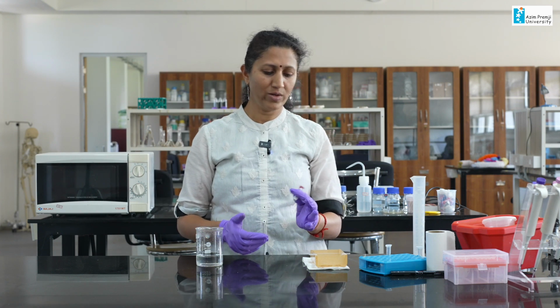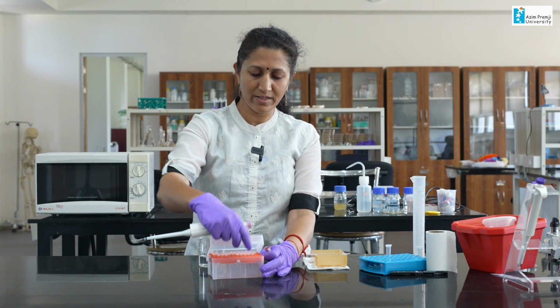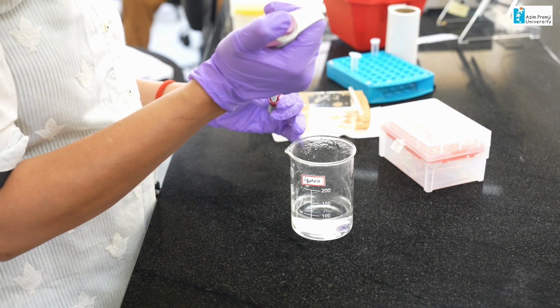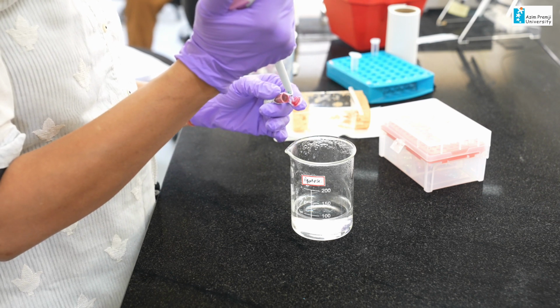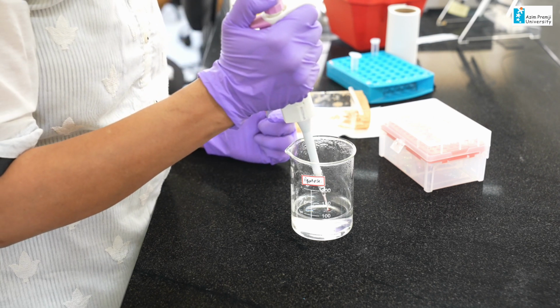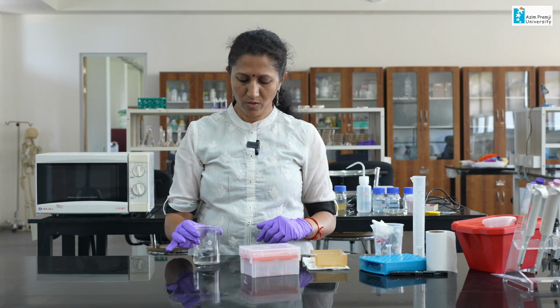Otherwise, there may be chances that people who do not know that you have used these tips or the container for this will come and touch them and then they may get contaminated. So, be very careful when you use ethidium bromide. It has cooled down. So, I am going to add 3 microliters of ethidium bromide. Now, mix it thoroughly.